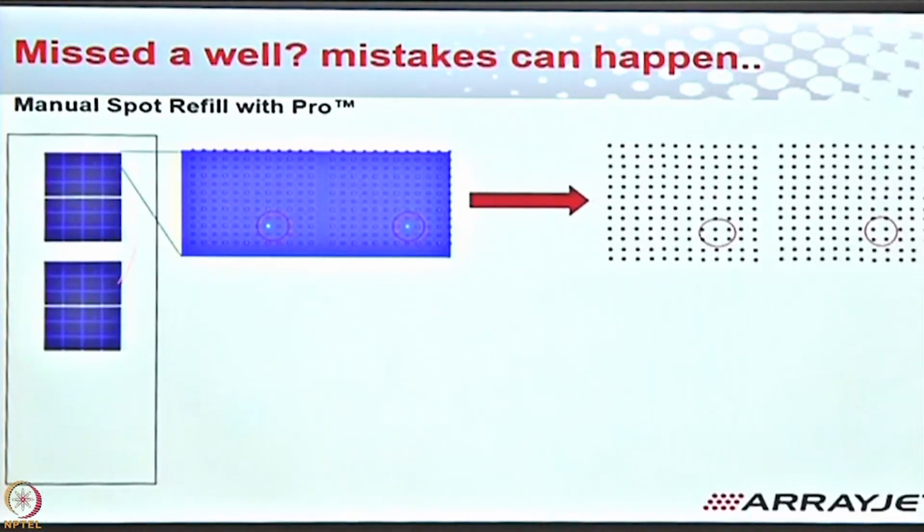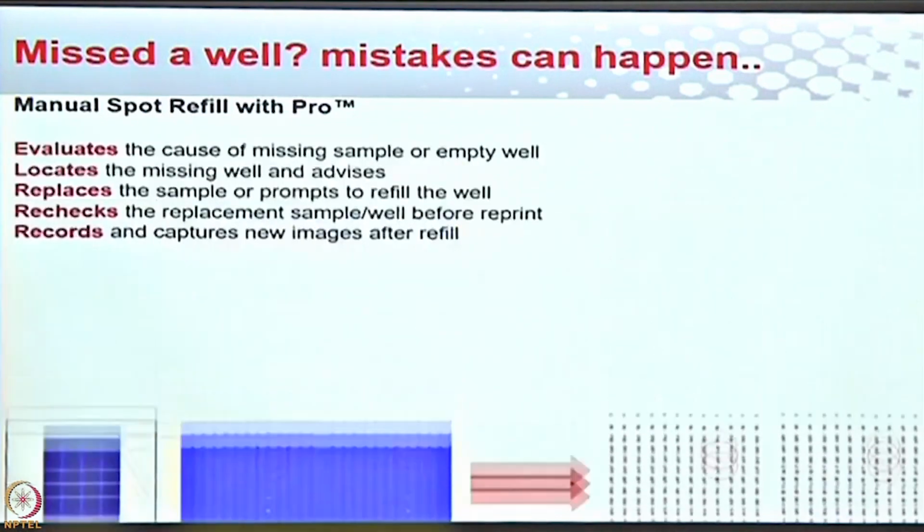And then when I start this overview run, the green area is where it will show me to confirm, to double check, to verify that yes, my antibody that I just went and refilled is definitely going to get printed. It's not that I'm missing my entire experiment and the whole thing has gone to waste. It'll remember it and it'll show you just to double check. Are you happy with this? Can I start? Can I press yes? You said yes.